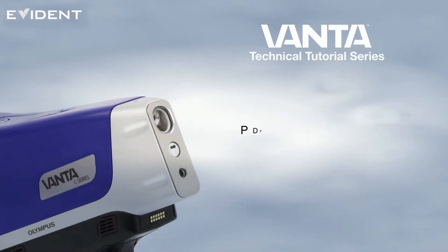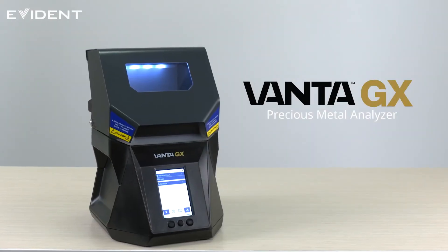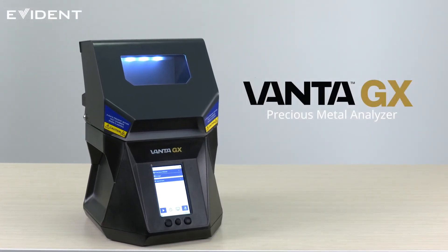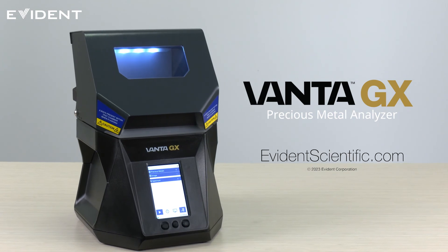Refer to the Vanta Technical Tutorial for instructions on configuring and exporting the results as a PDF. To learn more about the Vanta GX Precious Metal Analyzer, go to EvidentScientific.com.